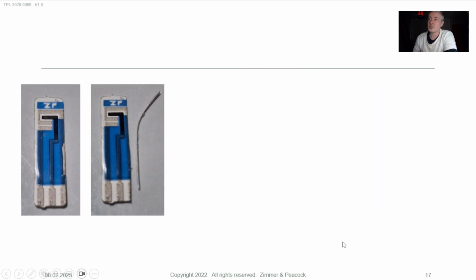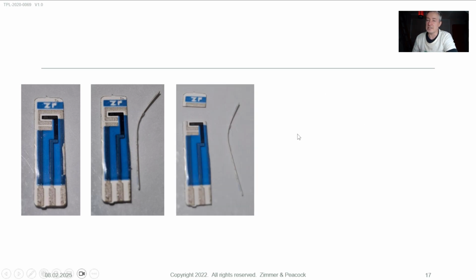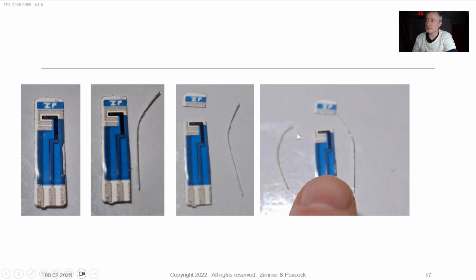I just wanted to show you that I took one of our pH sensors, in fact it was this one here, and I started trimming off the bits that you didn't actually need, and so you can get down to something like this. It's already on its way to being the right size for a pH sensor, and that's just by trimming off excess materials that are not otherwise needed.